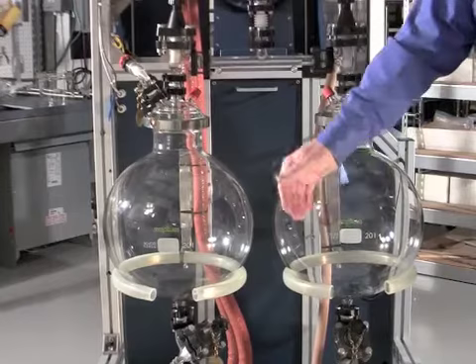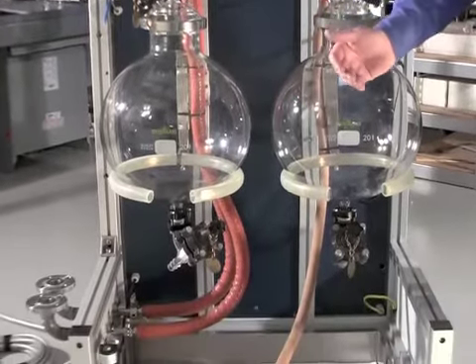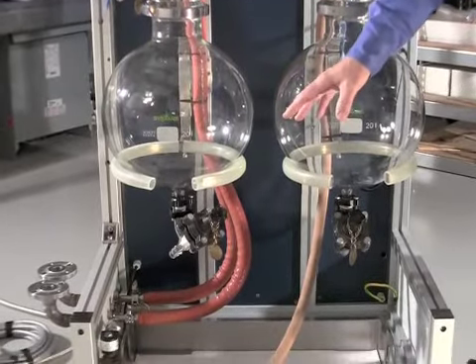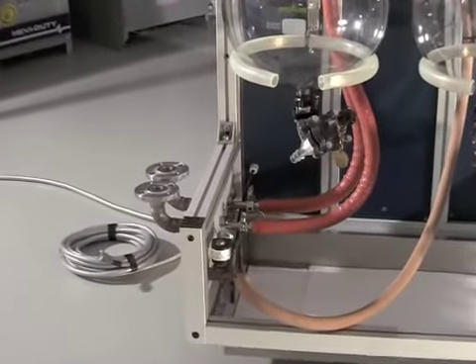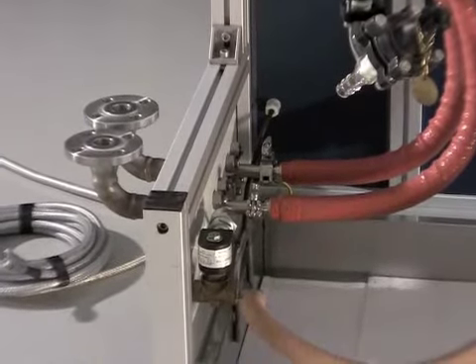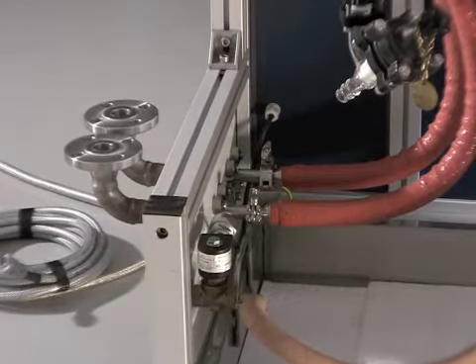Down below we see the utilities behind the utility panel. What you're looking at here are the explosion-proof solenoid valve and the inlet and outlet hoses, which are insulated, that allow the coolant media — either glycol or some other cooling fluid — into the heat exchanger or coil condenser.